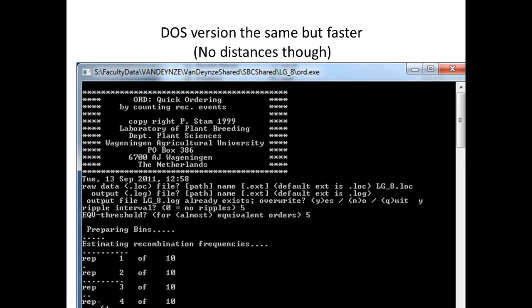So the DOS version basically has the exact same commands, but it's much, much quicker. What can take maybe 10 minutes for this subset of data set in WinRecord, or sometimes an hour with a large data set, takes literally minutes in DOS. With really, really large data sets, DOS is minutes. You can go in hours with WinRecord.